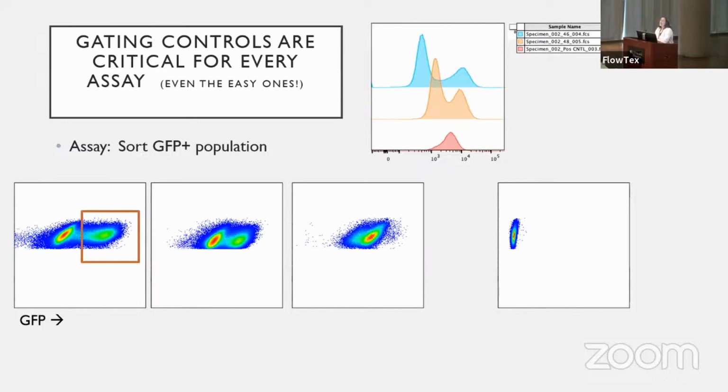Changes my mind. This is the untransfected control. And the only question I still have, and again, the key here is you need to talk to the people doing the experiments. You guys need to think about this. This is a great negative control with one assumption. What is the assumption I'm making for this negative control?